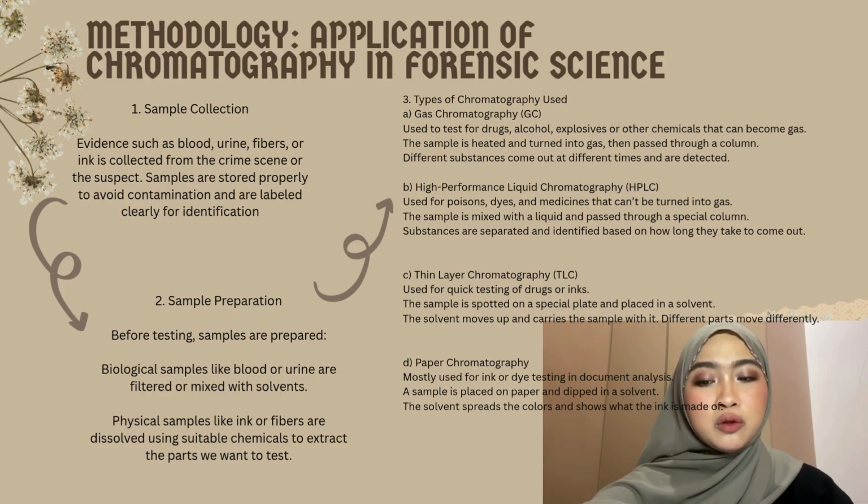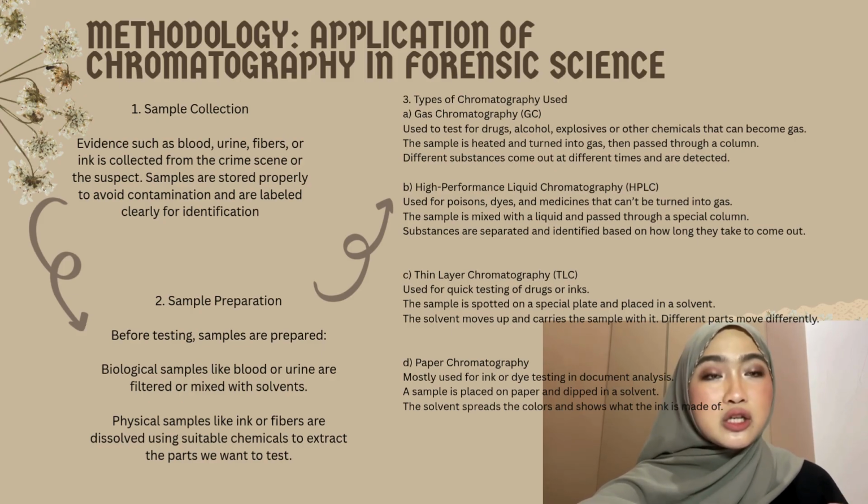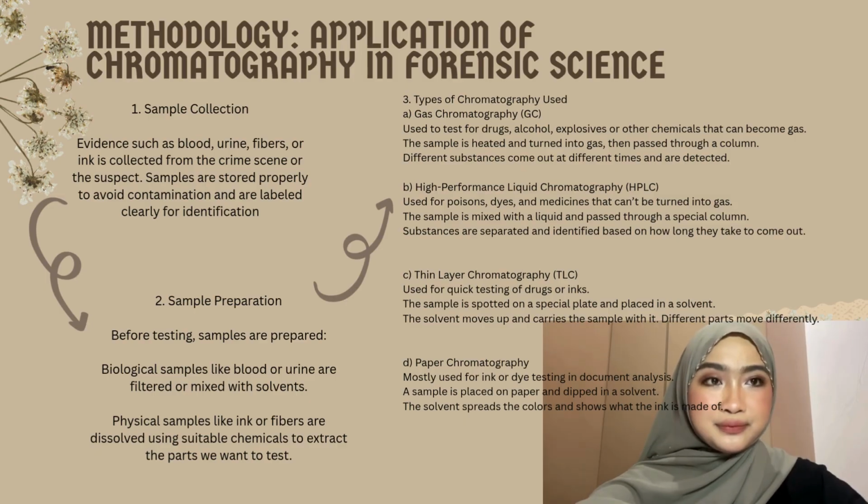For step 2, sample preparation. Before we test the samples, we need to prepare them. For biological samples like blood, we may filter or mix them with a liquid. For physical evidence like ink or cloth, it is dissolved in a chemical to extract the part we want to test.